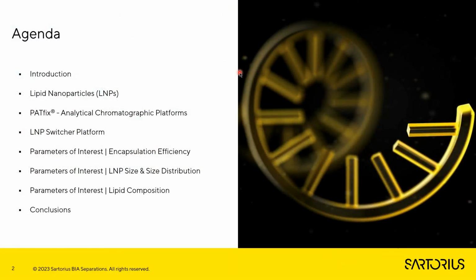I will start with a short introduction about our company. Then I will continue with an introduction to lipid nanoparticles. I want to show you the analytical platforms for different biomolecules developed here at BIA Separations for pDNA and mRNA.